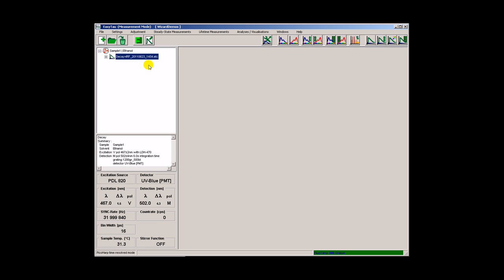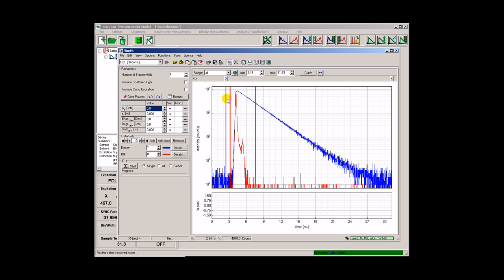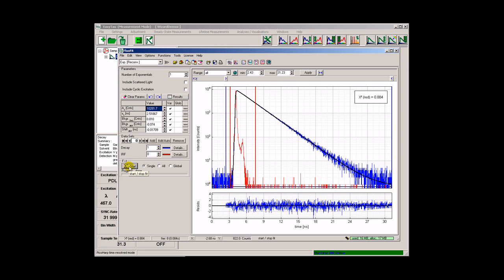Rigorous data analysis is just two clicks away. EasyTau starts the established Flow Fit with the just acquired TCS PC histograms already preloaded. We try to fit a simple single exponential decay model to the data. Let's simply press the start button. The result is a perfect single exponential reconvolution and a lifetime of 2.5 nanoseconds.